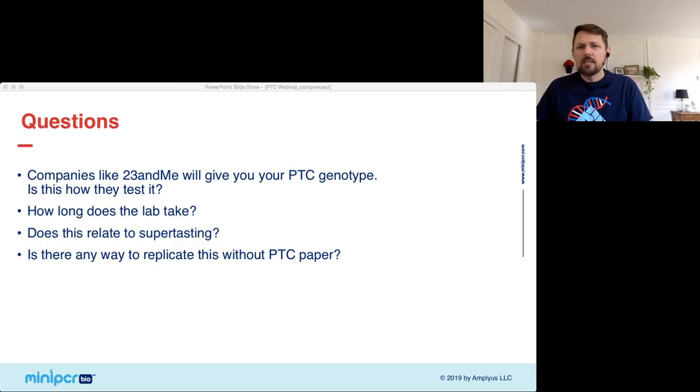How long does this lab take? So I told you throughout, but just a reminder, typically we say you can do it in 45 minutes and 45 minutes, 2 class periods. The DNA from a PCR is stable, so you can just set the PCR up and leave and it's fine. That second 45 minutes tends to be a little tighter, so if you do want to stretch things out, you can stop it after the restriction digest. You just want to make sure that you put your tubes in the freezer at that point.